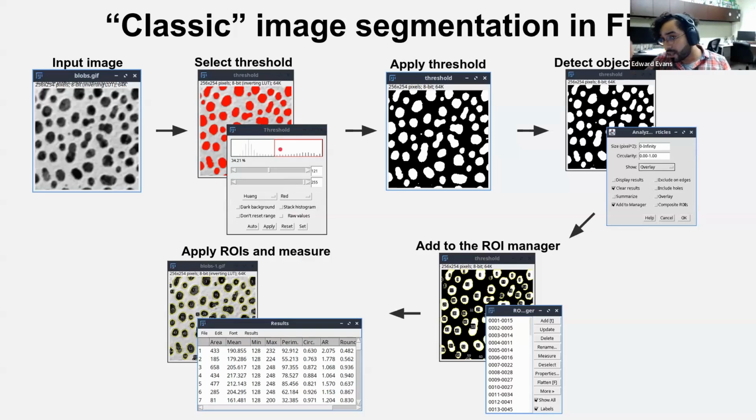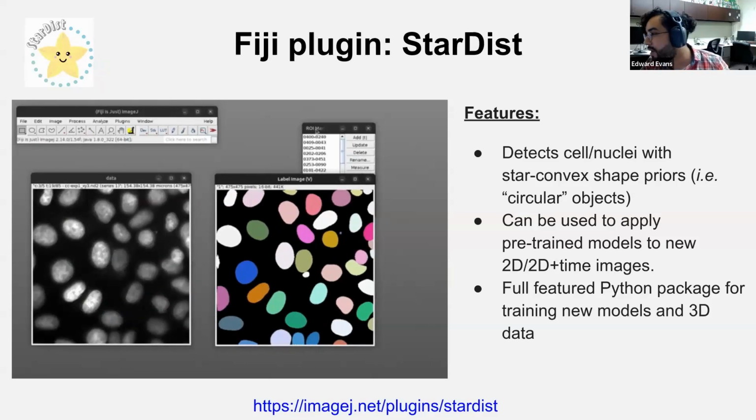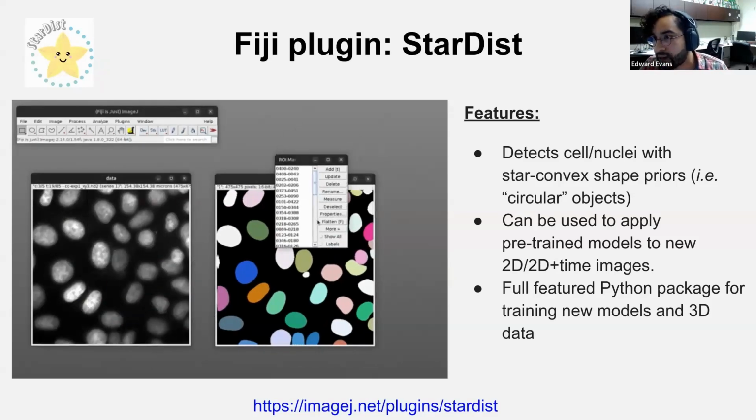And the other thing I want to say here is that this process also has image processing, right? So before you get to this threshold or component, maybe you tried all the thresholders and they all kind of aren't that great because they're still capturing too much of the background. Well, that means now you have to do some image processing, which would happen in between stage 1 and stage 2 of segmenting.